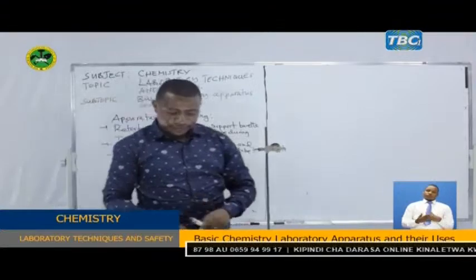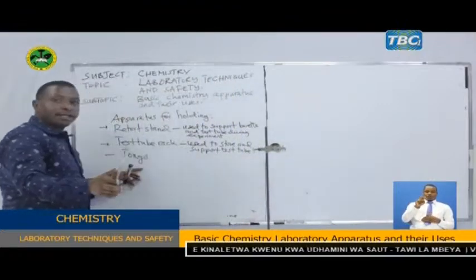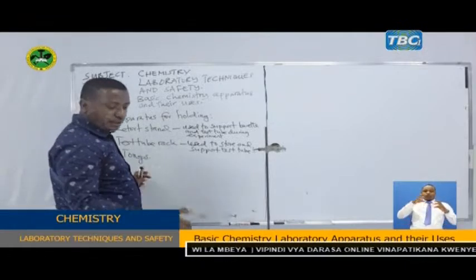We also have another apparatus which is this one here. It is called tongs. It is used to hold hot substances during chemical reactions or during heating processes.